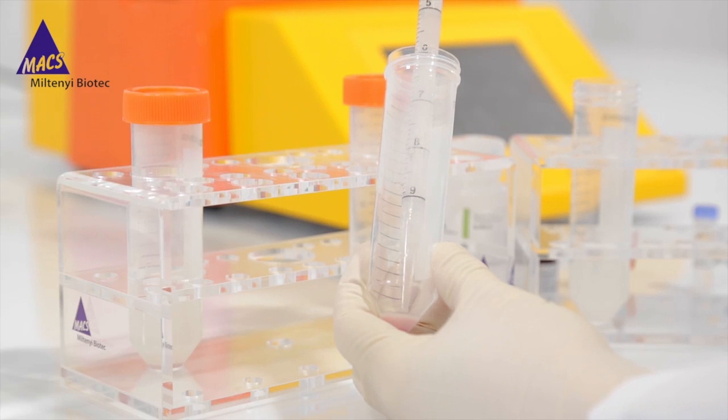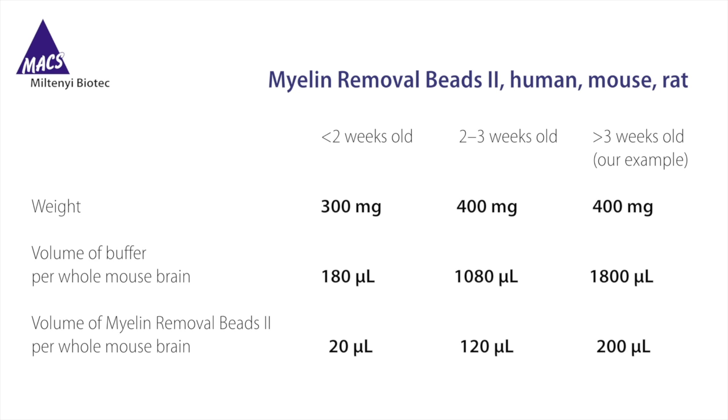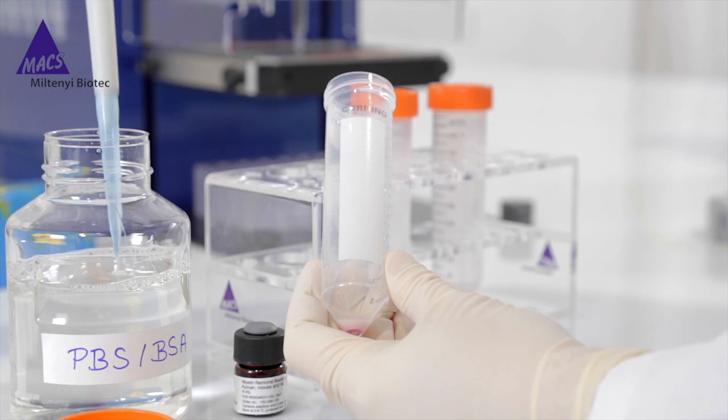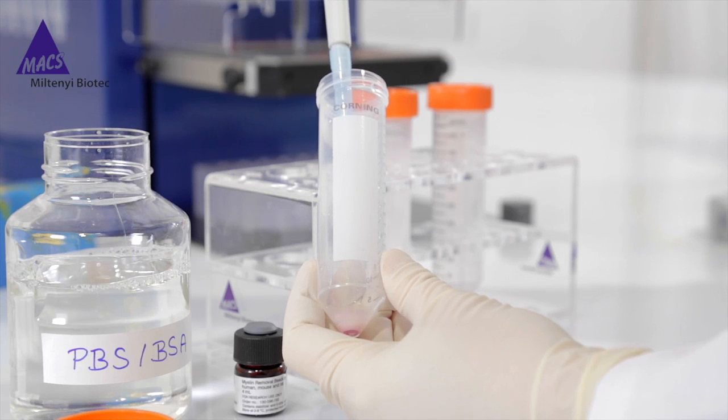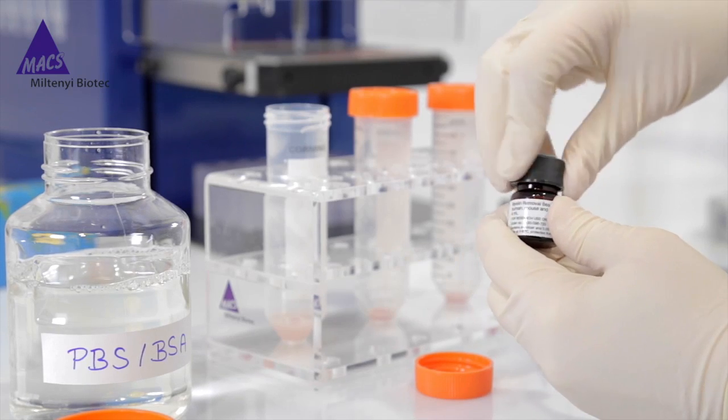Now we are ready for myelin removal. Myelin removal from a single-cell suspension is recommended when working with brain tissue of mice or rats older than P7, as well as human tissue. The older the mouse, the more myelin will be present. Therefore, the volumes of buffer and myelin removal beads depend on the age and should be adjusted accordingly. Resuspend cells with PB buffer to the required volume for myelin removal beads, then add to each 50-milliliter tube 1,800 microliters buffer and 200 microliters beads.